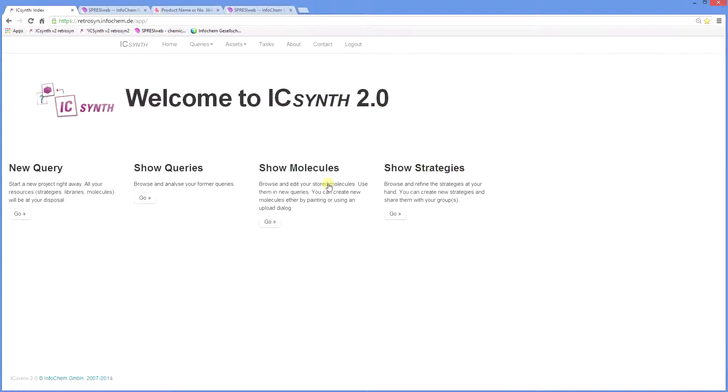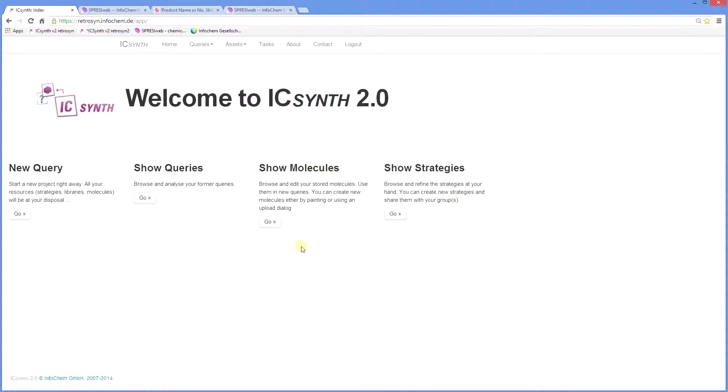After logging in you will see the home screen with the main commands across here. New Query is for starting a new synthetic analysis. Show Queries allows you to browse and analyze former queries. Show Molecules allows you to browse and edit saved structures and use them in new queries. And Show Strategies is an advanced feature that will be discussed in another tutorial.